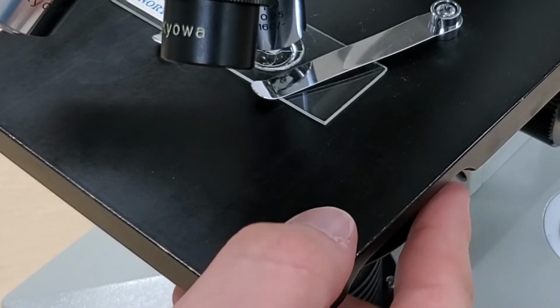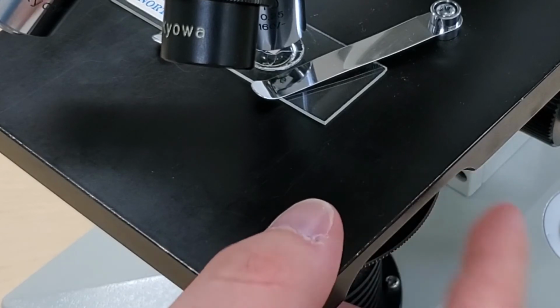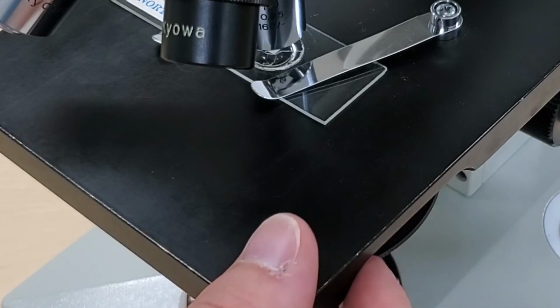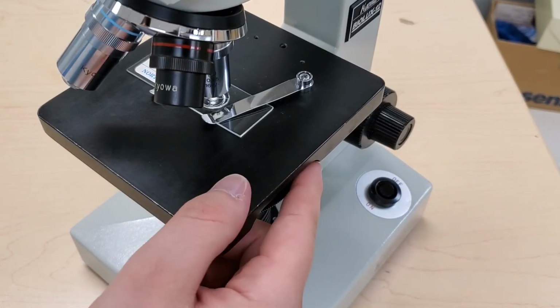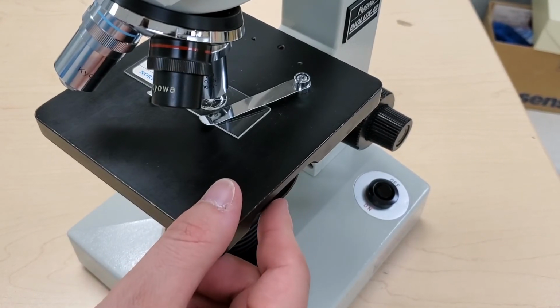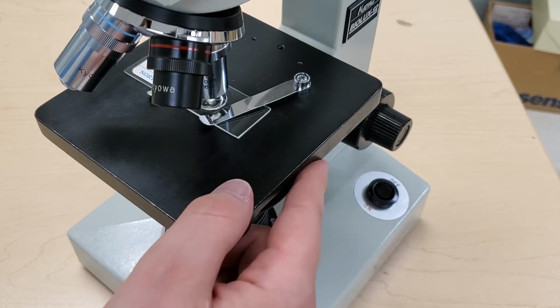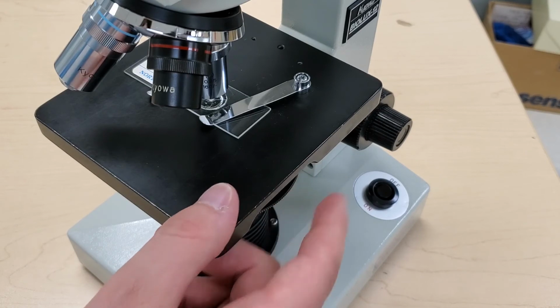You may also need to change the amount of light that passes through the stage and therefore through your sample. You can change this by turning the metal plate below the stage called the diaphragm. The plate has holes of different sizes that allows you to control how much light is passed through your sample. Too much light or too little light makes it hard to bring your sample into focus. It also makes it hard to see your sample in detail, and it can also be hard on the eyes. You may have to adjust the diaphragm every time you change the objective lens.